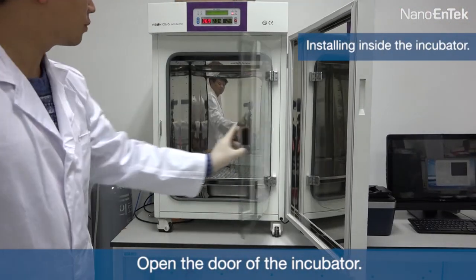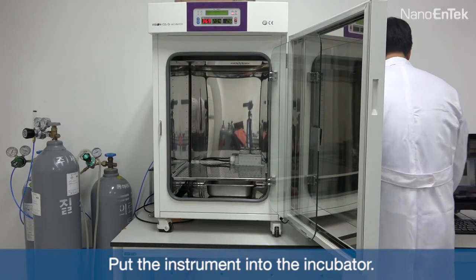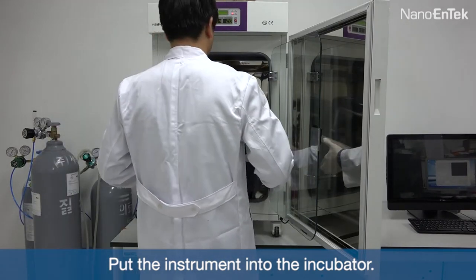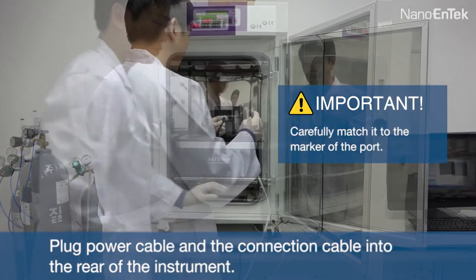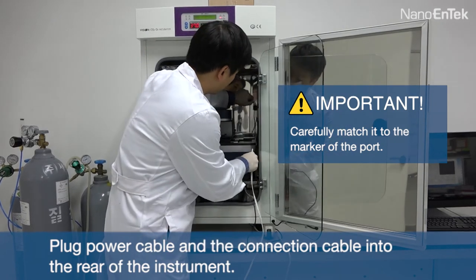Open the door of the incubator and put the instrument into the incubator. Then plug the power cable and the connection cable into the rear of the instrument.